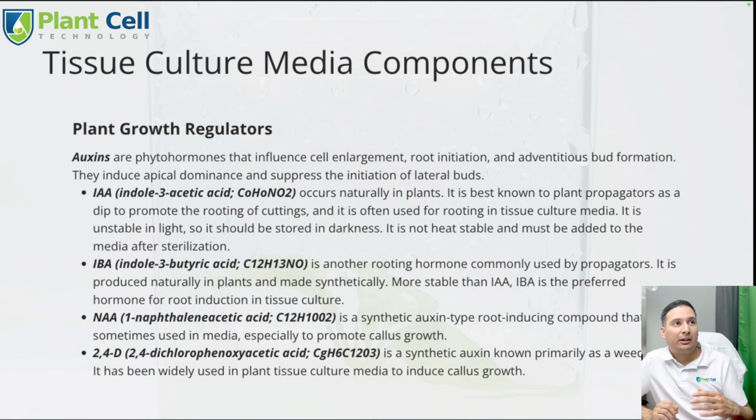About a year ago, I switched my media from using NAA to using IBA. I already made a couple of videos mentioning that, in case you're not aware. I changed from NAA because it produces a lot of callus on my plants, to IBA, which makes the plant look a little more natural, and they're a lot easier for me to take out of culture and place in soil. They root a lot faster.